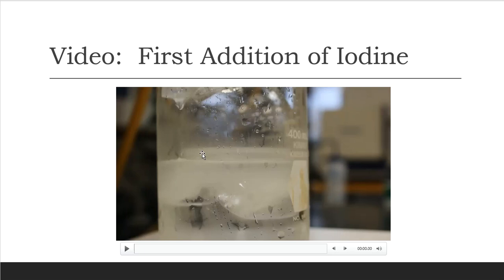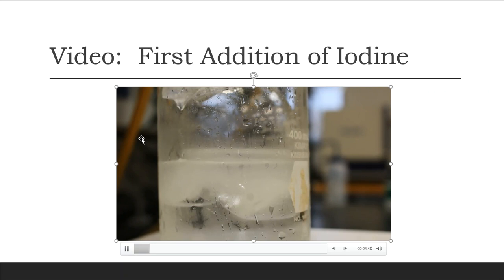Guys, this is the ice water bath, and it's really before I've added any iodine at all. Of course, that's why it's clear. So I'm getting ready to add my first portion. It tells me a few drops, and that's what I'm going to do. So I'm going to open up the stopcock and add a few drops, and this way you can make your observations as you see fit in your lab notebook.